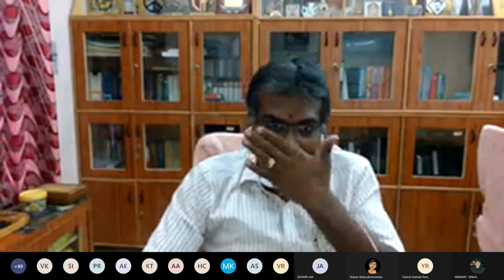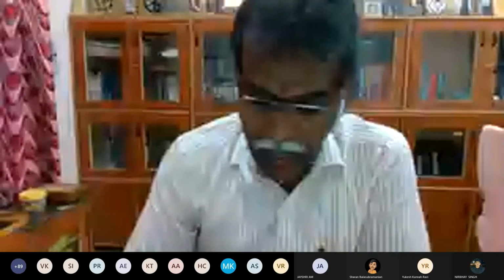Okay, yeah. Here also again the principle. Probably you would have come across the measurement of turbidity by photometry and nephelometry. So these two concepts you would have studied in the last semester: photometry and nephelometry. So photometry, you just have a sample and you pass the light, and you can measure the absorbance of light just opposite to the direction of light. That is called photometry. That you would have studied in the last semester.